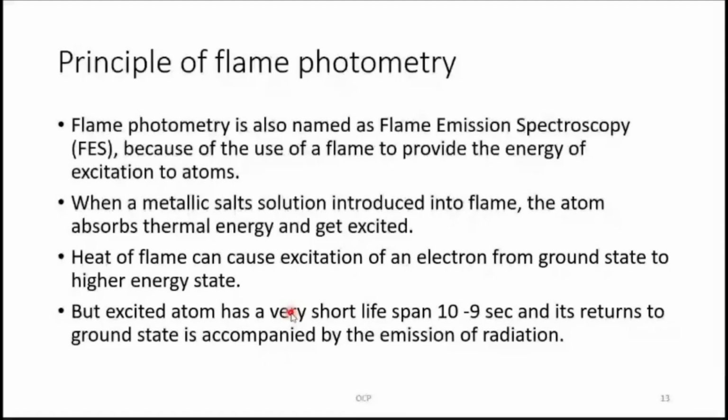Now, lingering around the second point, when we talk about salts, it is the complete exchange of electrons between the cation and anion. If you introduce such a salt in the flame, the salt molecules absorb that thermal energy, and both cation and anion get excited to a higher energy state. The heat of the flame can cause excitation of an electron from the ground state to a higher energy state. It is obvious that atoms, specifically the electrons, can absorb the energy from the flame.